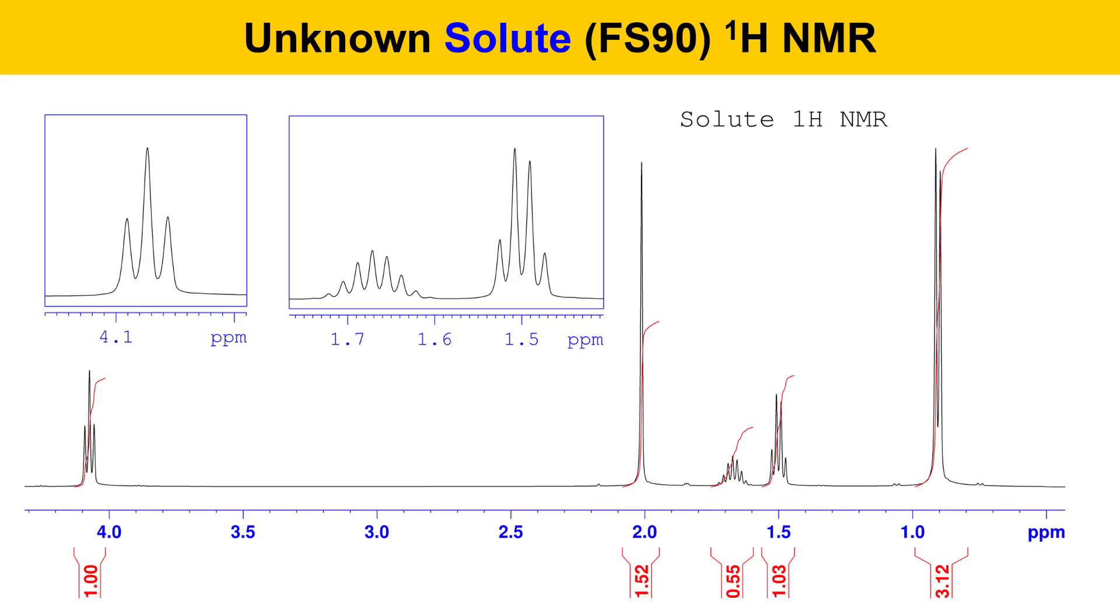So now on to data for the unknown solute. This is a proton NMR spectrum of the unknown solute associated with unknown FS90. This is the unknown solution that I'm featuring in all the videos for this experiment. This spectrum was acquired in chloroform D, and integration values are shown both below the spectrum in numbers and also as integral traces above the peaks. And I have expansions of several multiplet regions, so you can clearly see the splitting. There's a signal A, which I have shown here that's at about 4.1 parts per million. There's signal B, which is a singlet. Then there's signal C, which I have an expansion of, along with signal D, which is also shown as a blown up region. And then there's signal E, which is a big doublet. Integration values are shown below in red, and the red traces above each peak also represent the relative ratios of the protons.